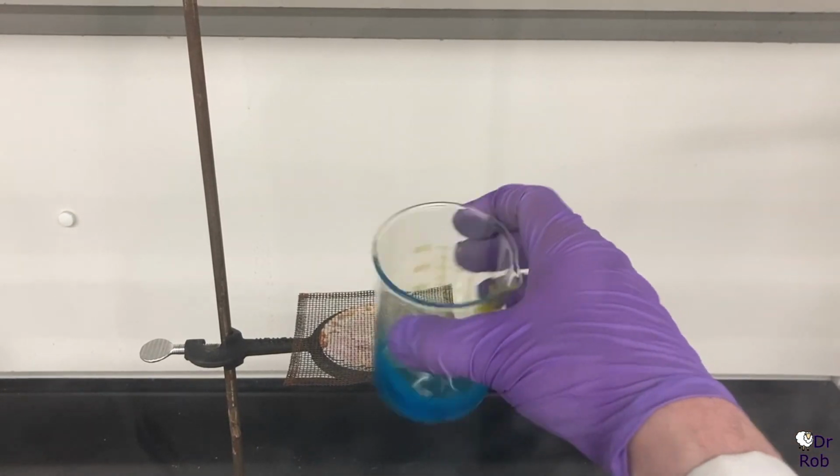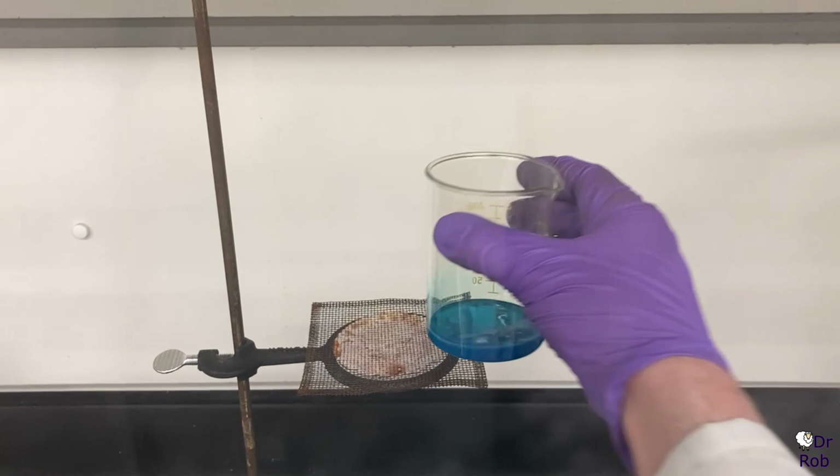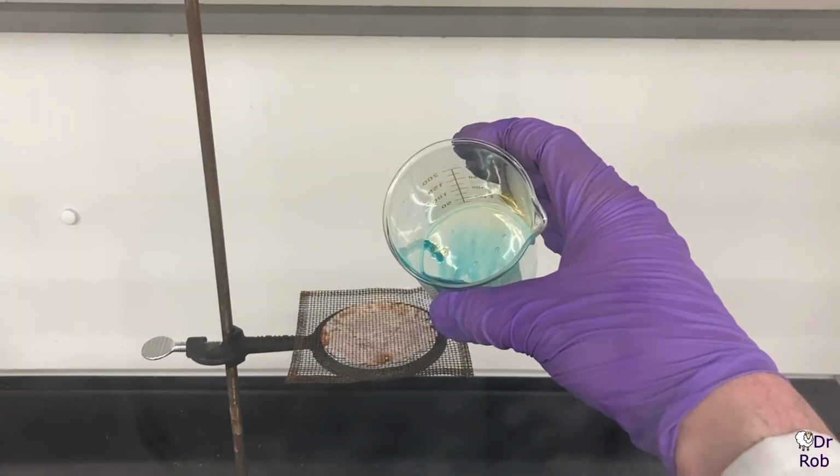And then there we see the polymer film that's left over. There's no metal left over, it's just the shadows of the polymer film. The polymer film, like I said, is on the brass. I suspect that it's there to prevent corrosion or something. I'm not totally sure, but it doesn't really interfere with the reaction at all, which is a testament to how durable some of these plastics are, that they're able to just sit there in this really strong acid and not do anything at all.